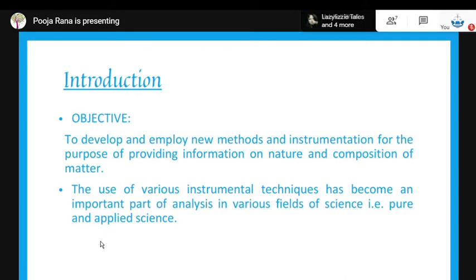These non-destructive techniques play the most valuable role in forensic science, as these tests can be conducted on very small samples, and they do not even require extensive sample preparation before the measurement. And with these advanced techniques, quality and precision requirements can be met efficiently, and this is an important step in official recognition of the quality also.